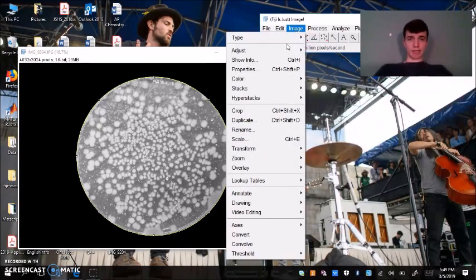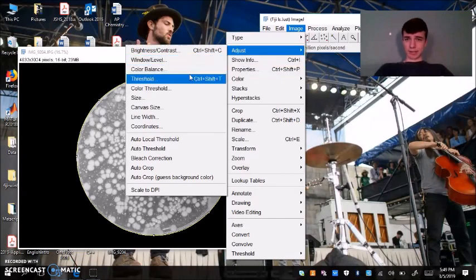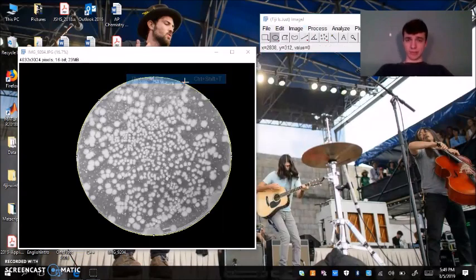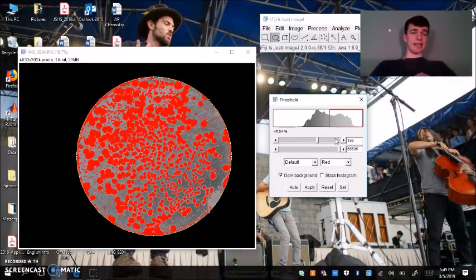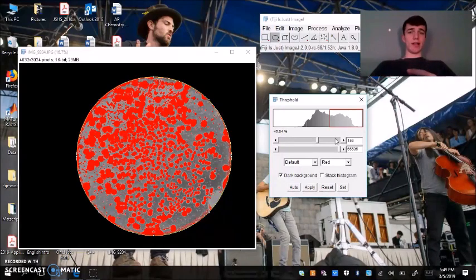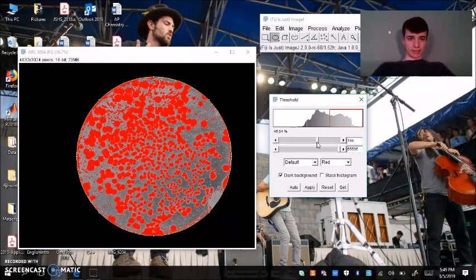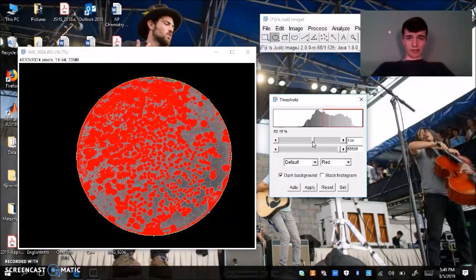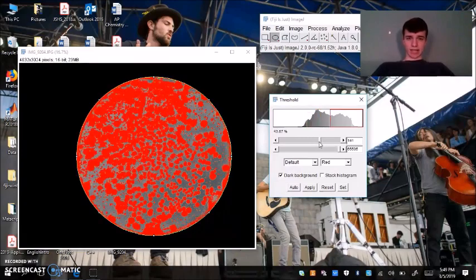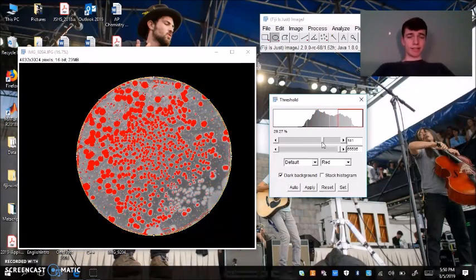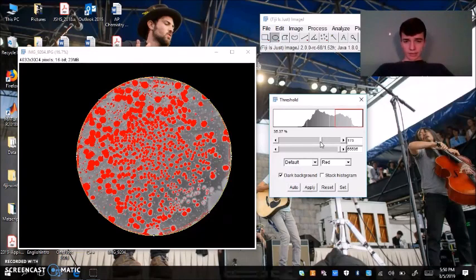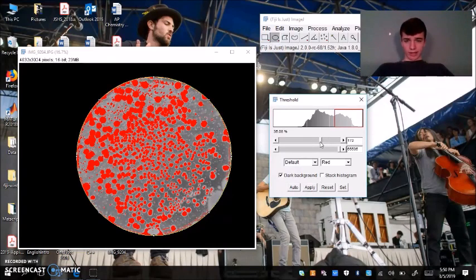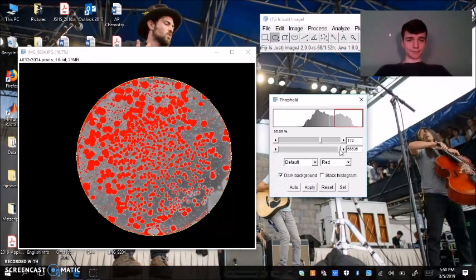We're going to Image, Adjust, Threshold. What thresholding does, it allows you to select a certain region of your image that you want to analyze. Using these two bars, you can select more of your image or less of your image. But in this instance, we just want to select our colonies. So I'm going to try to find a middle ground here. I think that looks good.